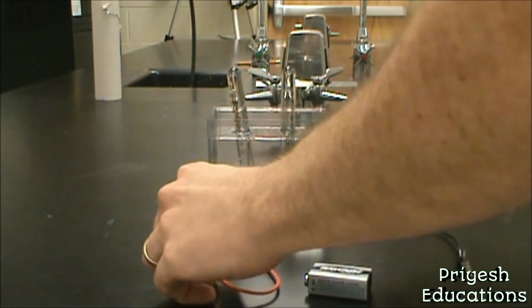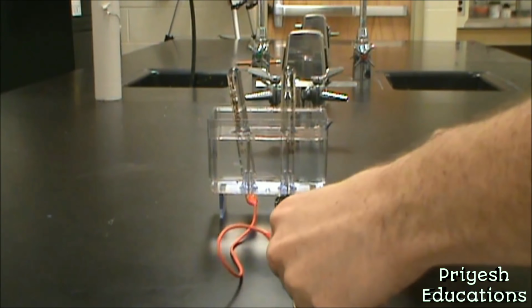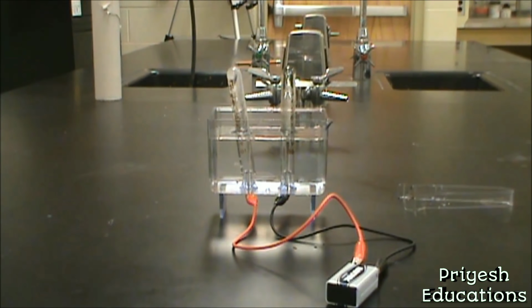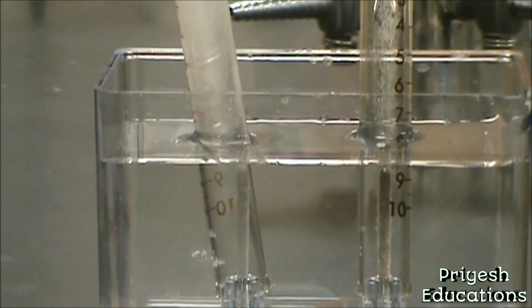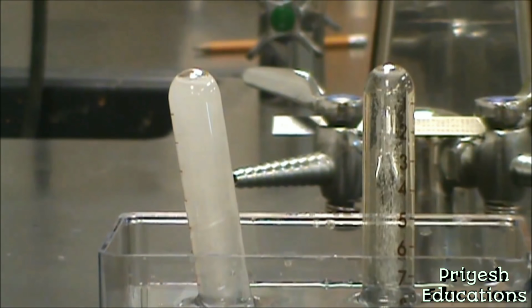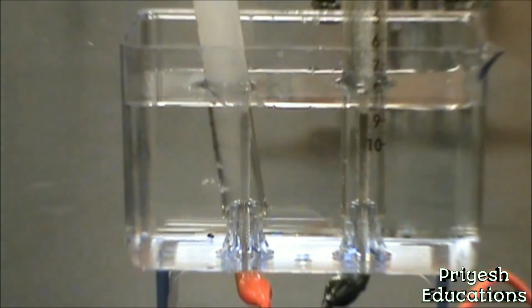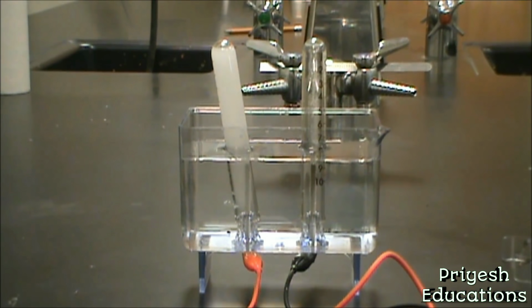So we're going to run a red lead to the negative terminal of the battery, a black lead to the positive terminal. And when we do that, you can see bubbles starting to originate in there. I'm going to zoom in so we can see that up close. And that gas is collecting on the left and on the right. So we're going to let that run until we've collected enough to make a measurement.